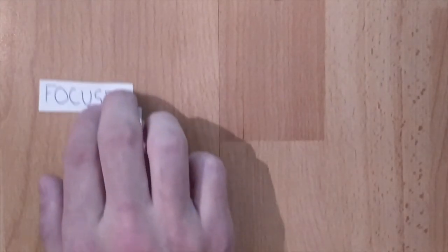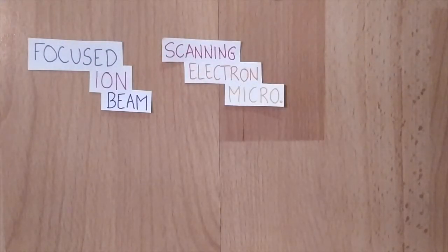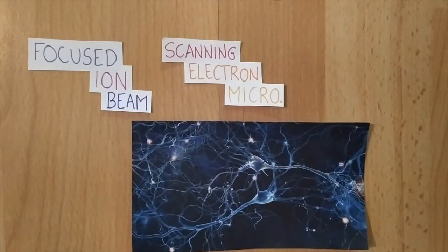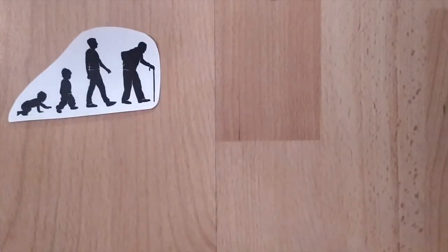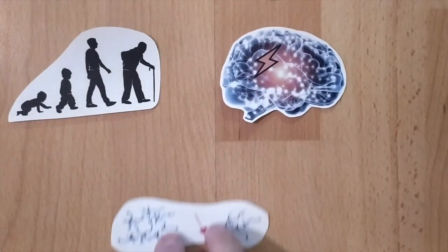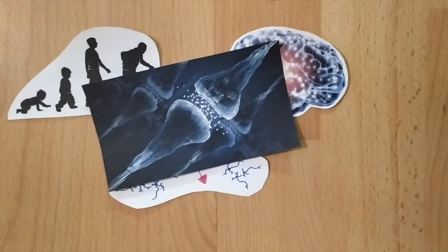So, as you saw, comparing with other imaging techniques, this SEM technique allows us to define many important features of brain organization and is a major tool to study brain's microanatomy. This offers great opportunities for the future to understand the impact of aging or diseases on the number of synapses, and also to get a clearer representation of brain synapses by using 3D. To conclude, it doesn't matter how ugly you look if you're just the best microscopy technique in the world.